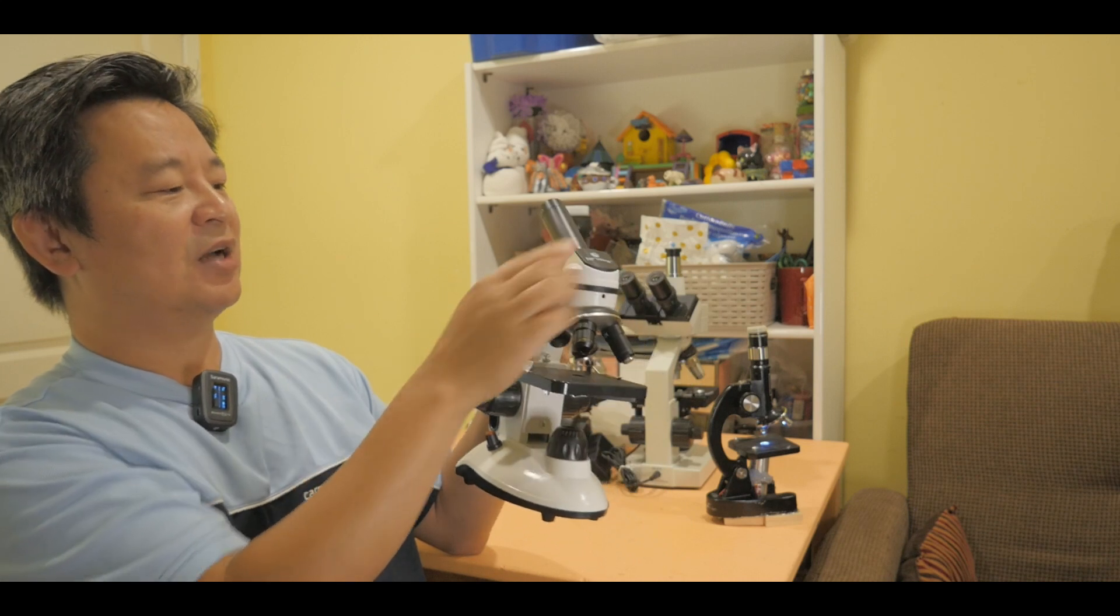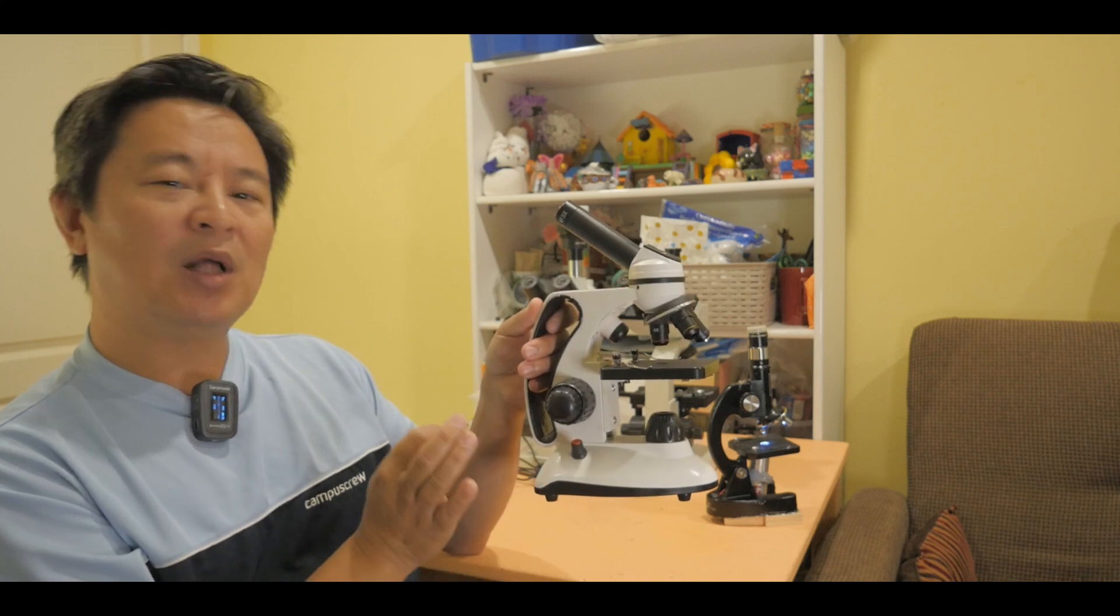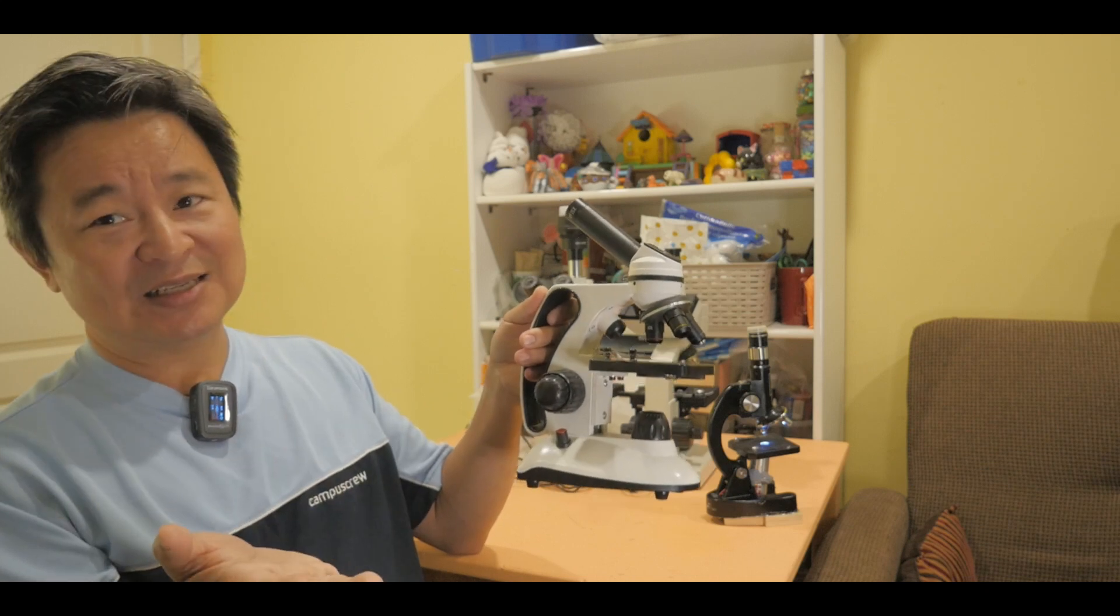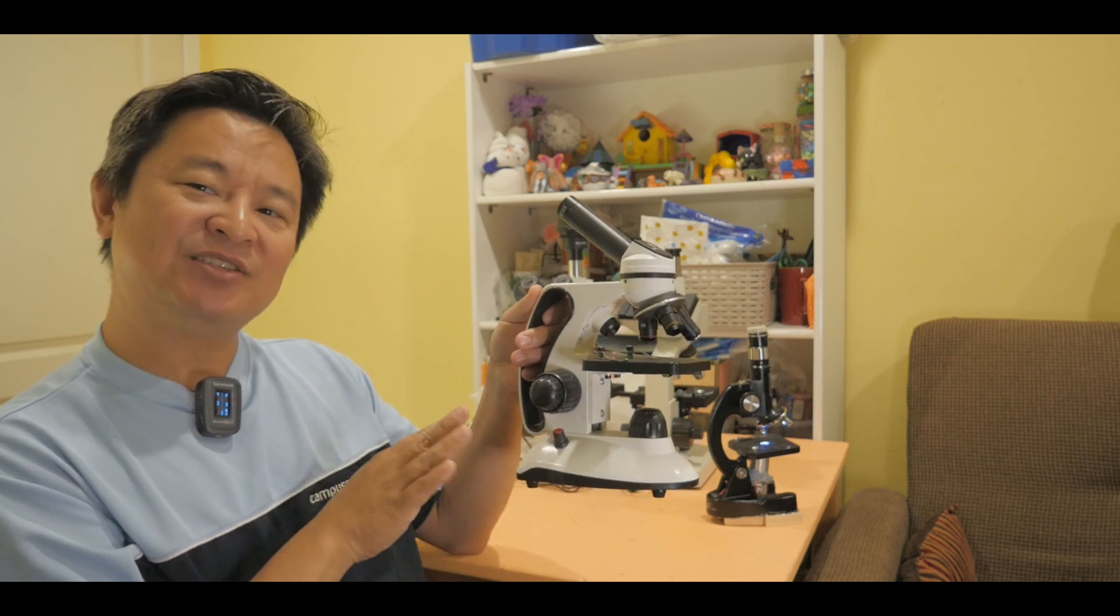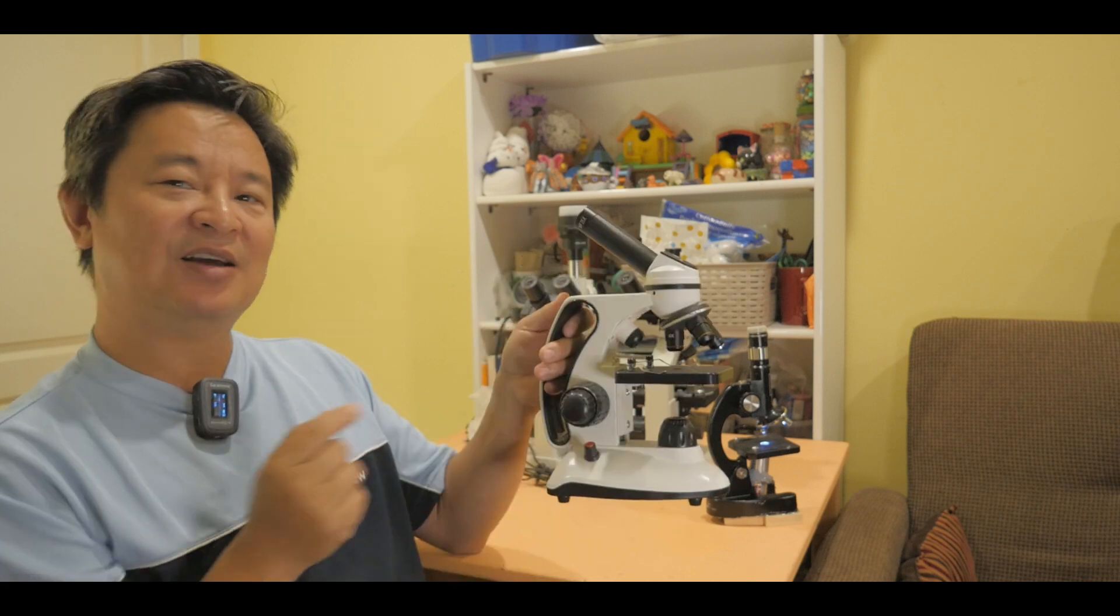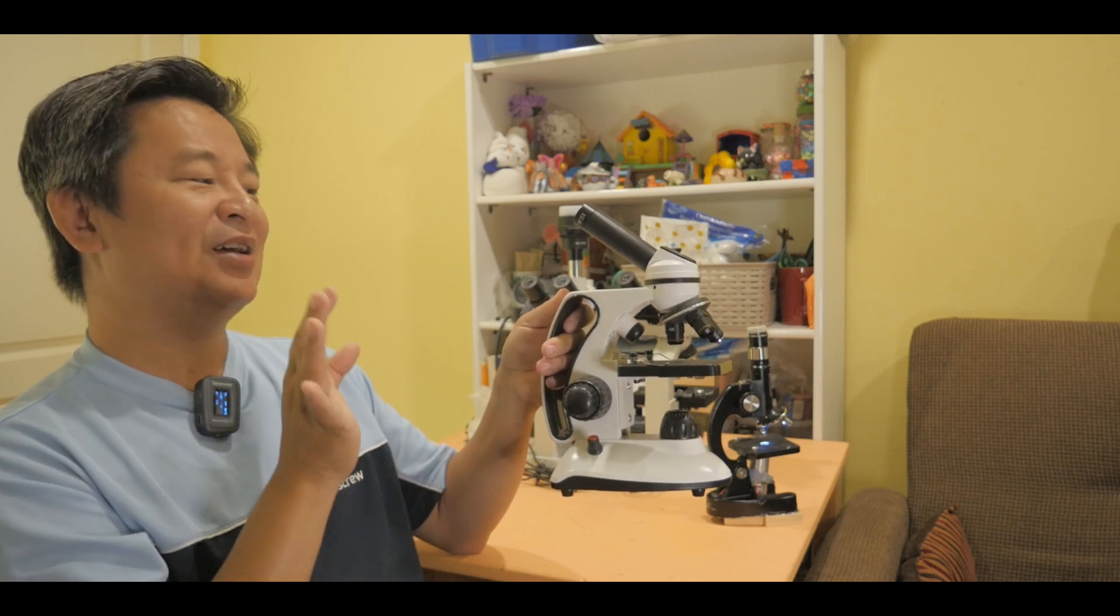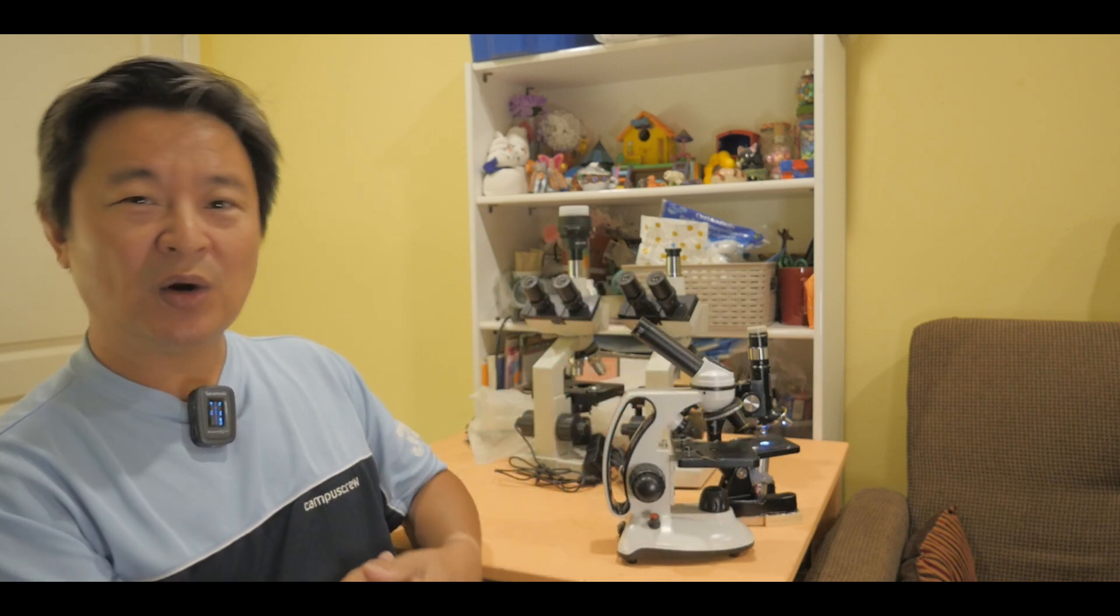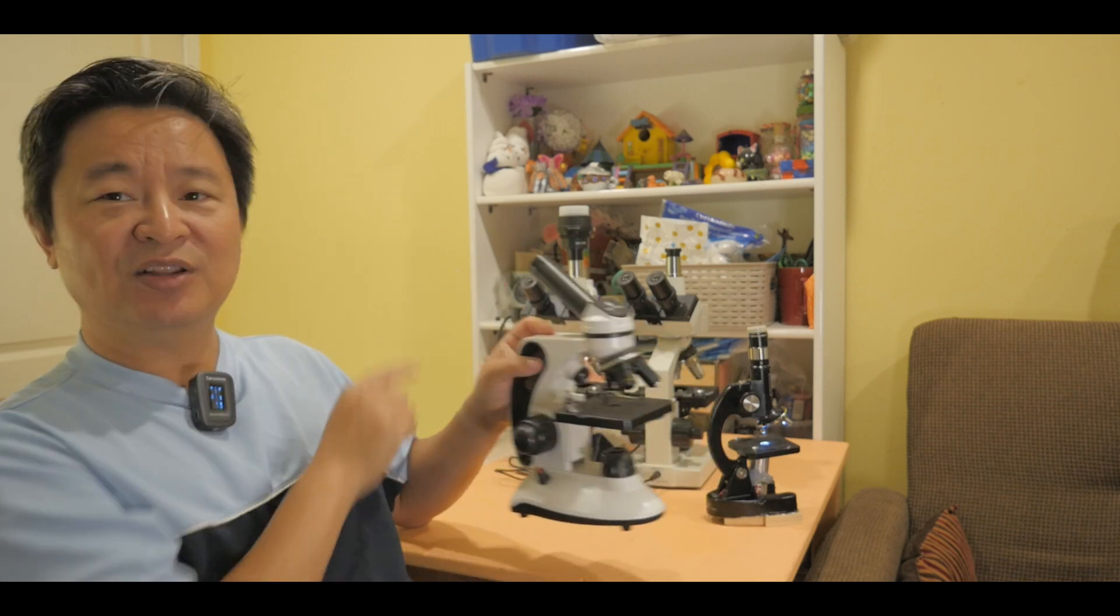This is known as the monocular compound microscope, right? It's a decent microscope for starting out students. The image quality is just okay. It's not the best for a hundred dollars. I guess that's what you expect for this type of technology. Now, if you can get it cheaper, that'd be great. But if that's your budget, yes, this is the microscope. I would say starting out, this is the microscope you want to get. Now on the website, they're saying this thing can go 2000 times. I would say that's a lie. Normally a light microscope, the best resolving power is around 1200, if that, right? It has to do with the best optic lens, best ocular lens.